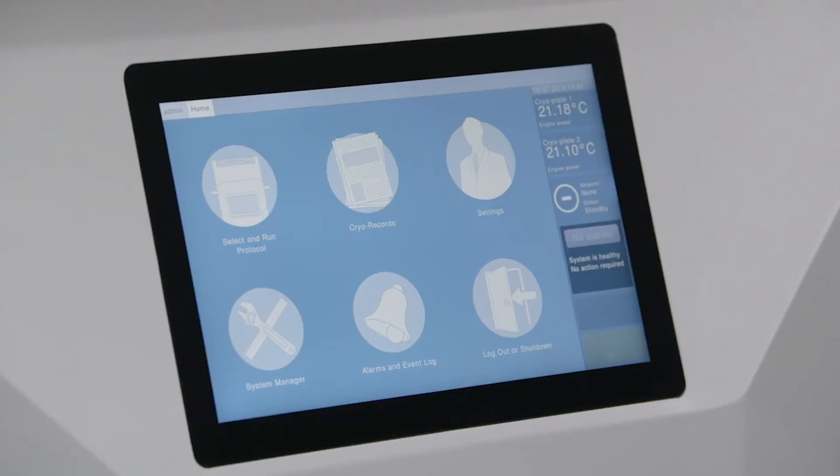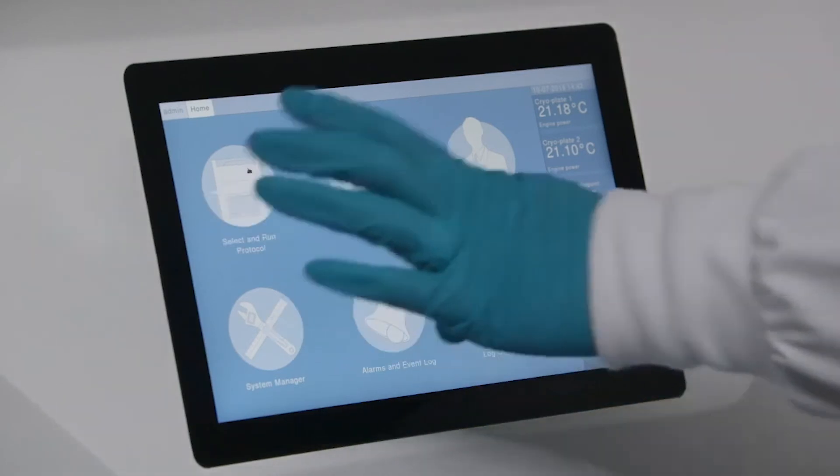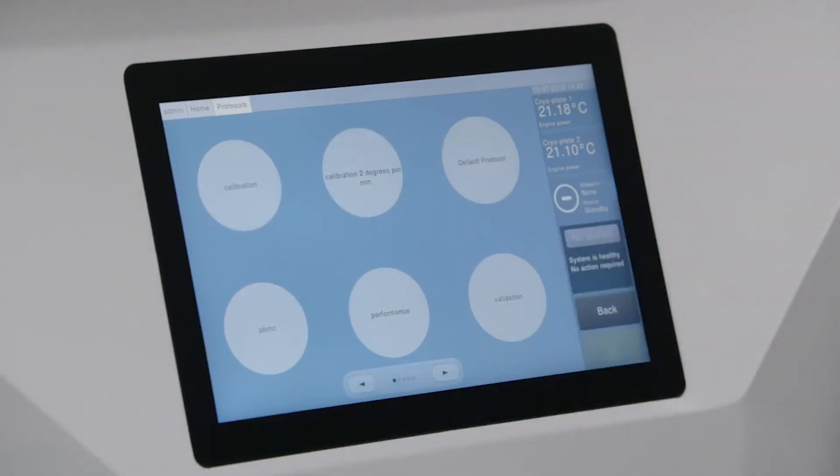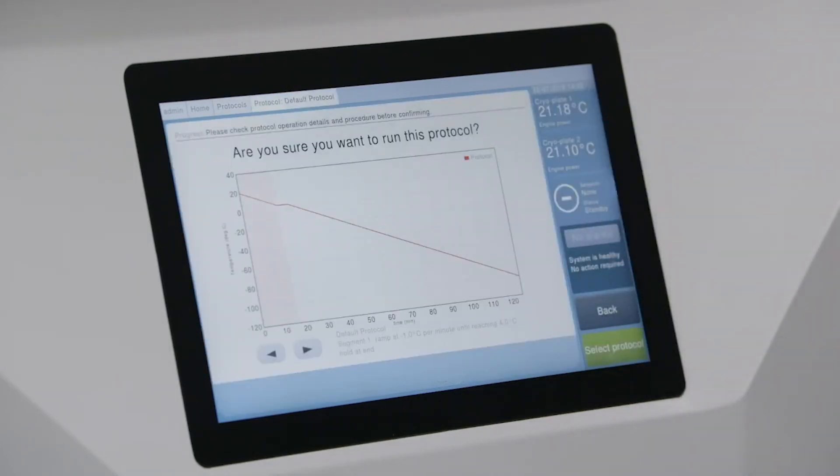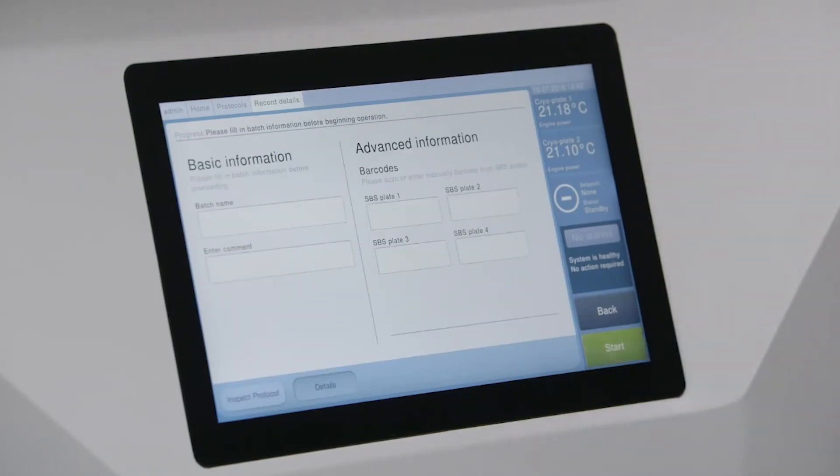From the home menu, click on select and run protocol and it will show you all the protocols previously created. For example, today we're going to use the default protocol. Once we select this protocol, there will be the option to input information pertaining to your samples. You can verify the characteristics of each segment by referencing the inspect protocol information located under the record details.